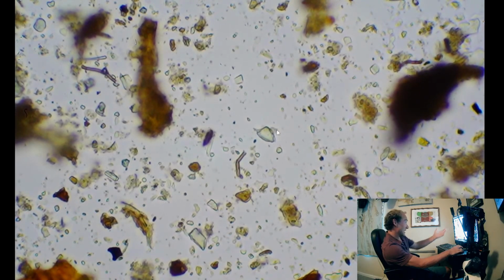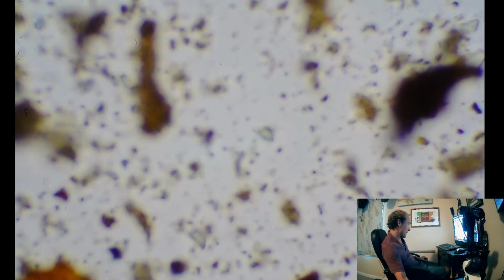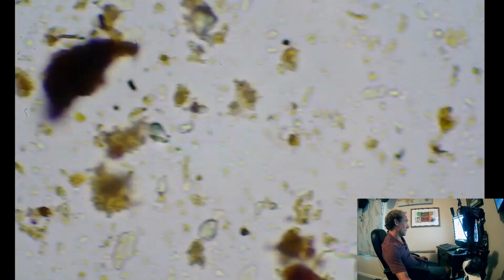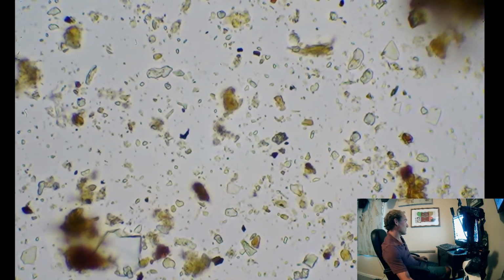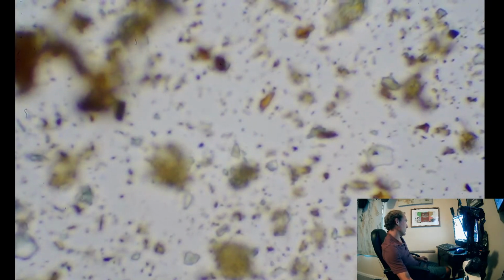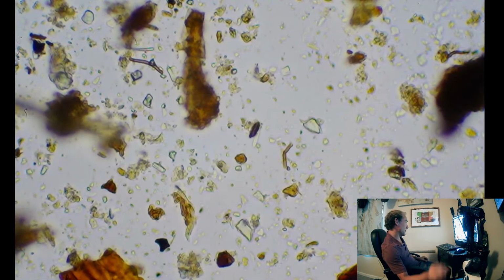With having as much bacteria as you see down here right now, this is high average. Yeah, actually, we had a couple of good, nice fungal.